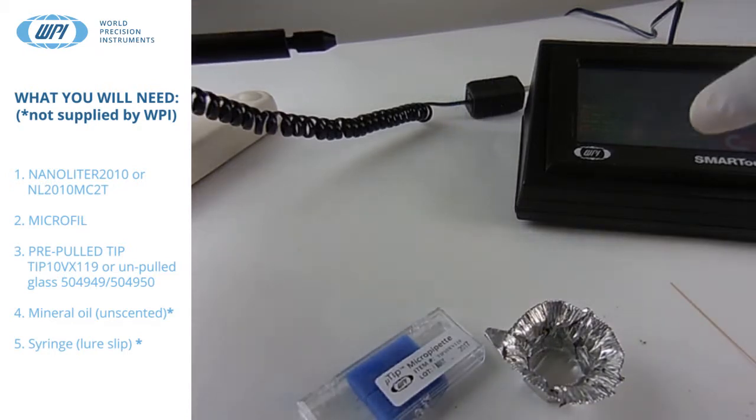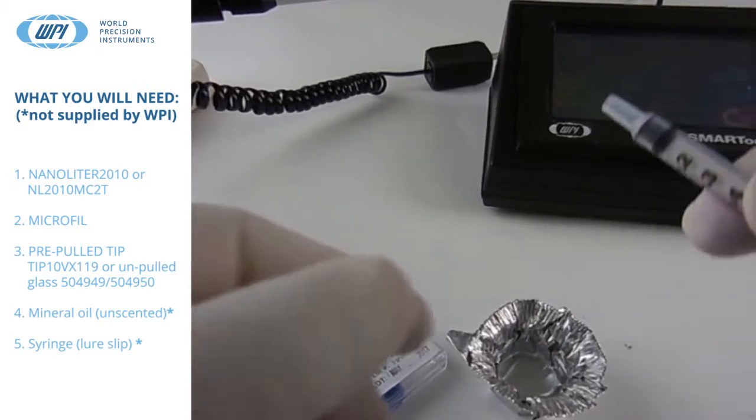The first thing we need to do is fill the syringe with mineral oil about halfway. Slip on the microfill to the pre-filled syringe with mineral oil.